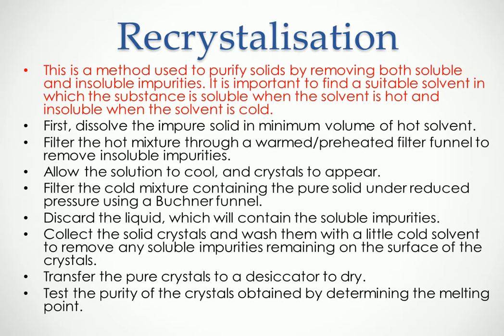So after doing so, we're going to transfer the pure crystals to a desiccator to dry. So we're going to dry it using a desiccator, and we must note that we do not use an oven to dry it, because if you use an oven, then at really high temperature you might decompose the crystals. So in actual fact, you haven't dried it, but you decomposed it into a different substance. So we use a desiccator to dry it, so the crystals are still the same substance that we want.